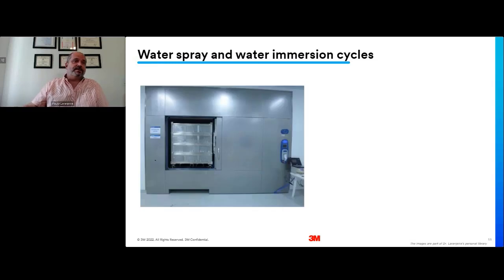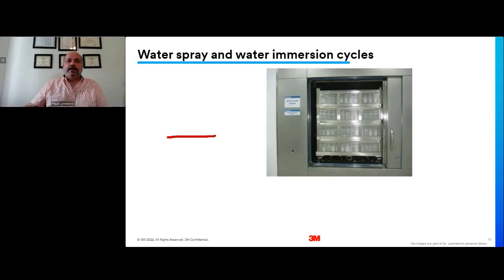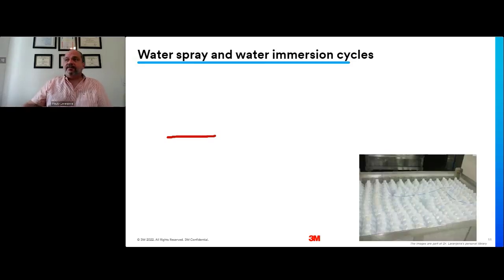Another use of steam sterilization is what we call water spray or water immersion cycles. You're going to have vials with either a shower of steam from the top through them, or the chamber is going to be filled with water, and it can be 3/4, half, it doesn't matter, it depends on the cycle development. And the products are going to be sterilized in that manner. Normally you see that when you have plastic vials, because the plastic does not support the pressure oscillation. So if I have the flask in water or a spray cycle, it will not deform the vial.